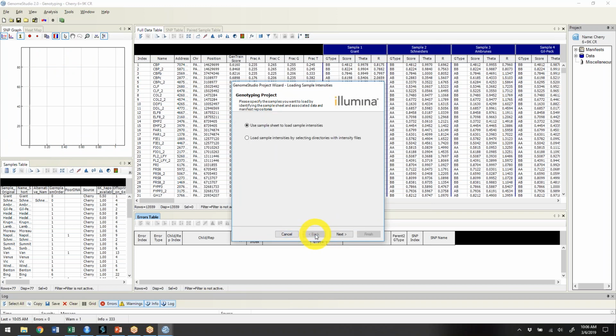except that, one, you don't have to name your project anymore because it's already been named, because you're adding to the same project. And you don't have to give the manifest file, but other than that, it's pretty much the same steps as we did before to get new data into an existing project. So that would be the other way to load those two folders we had originally, rather than copying everything into a single folder, is loading them one by one into a project.